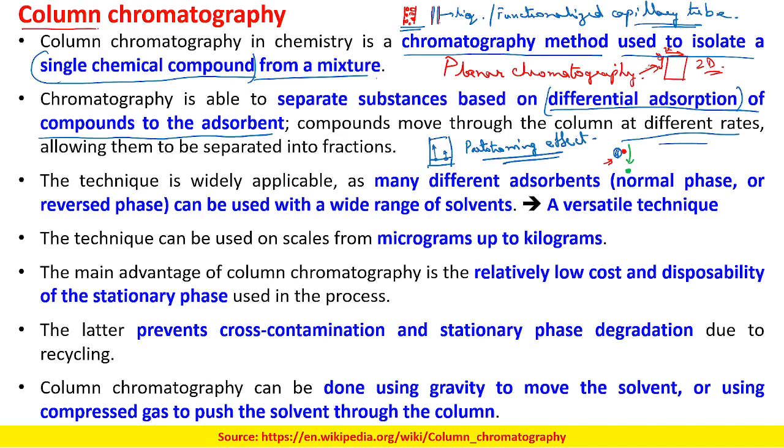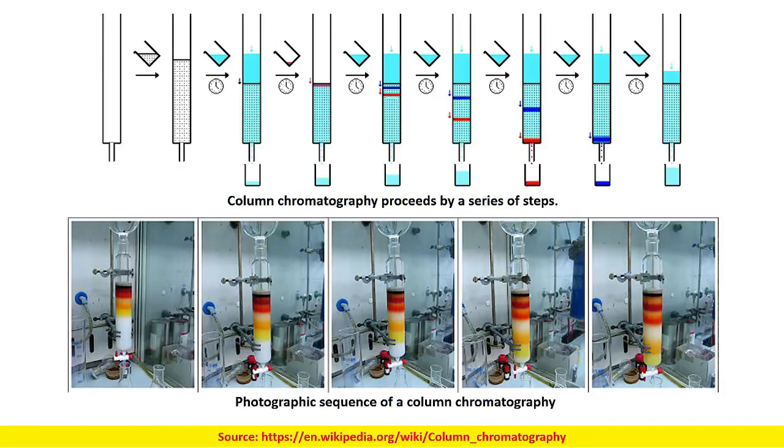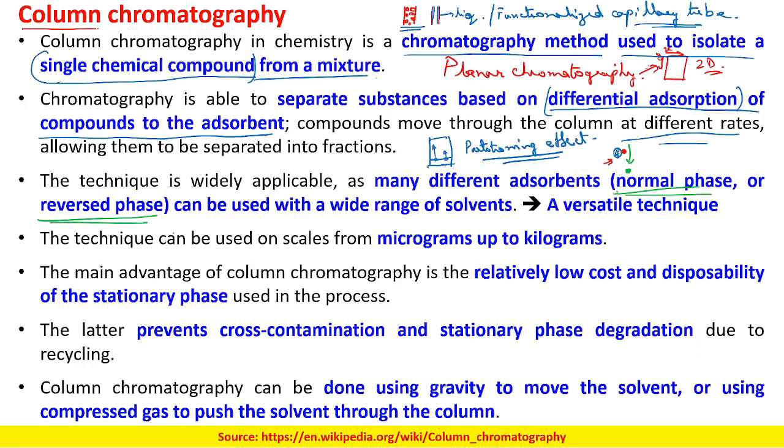just like in TLC, or planar chromatography, where we had normal phase chromatography and reverse phase chromatography, here also we have normal phase chromatography and reverse phase chromatography.